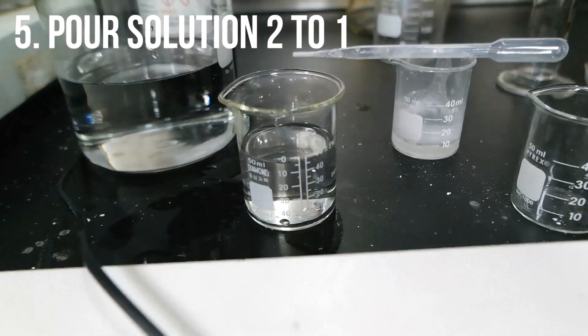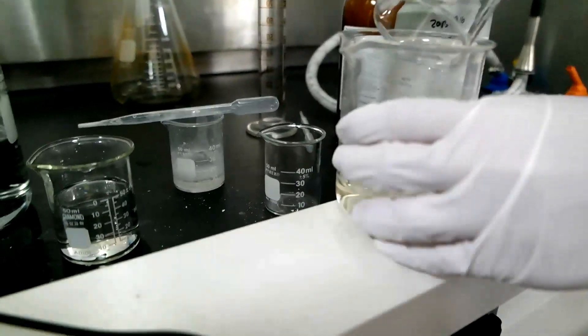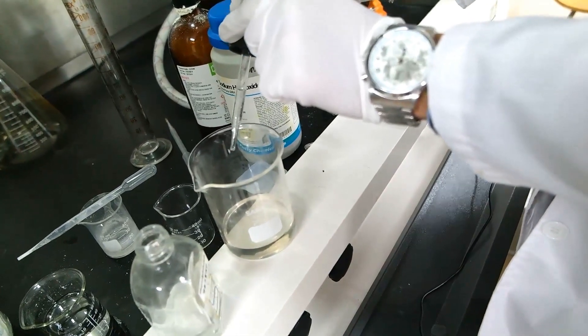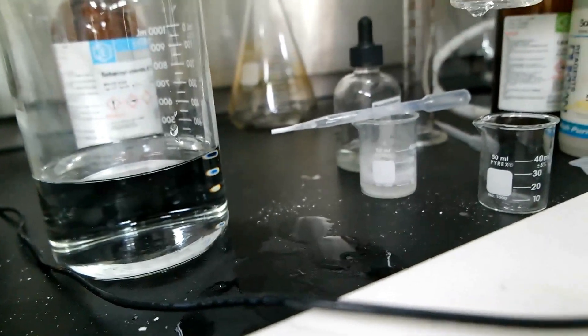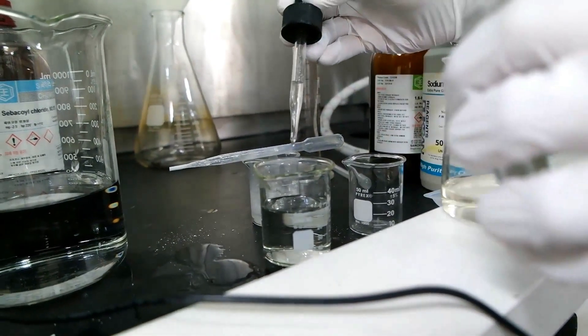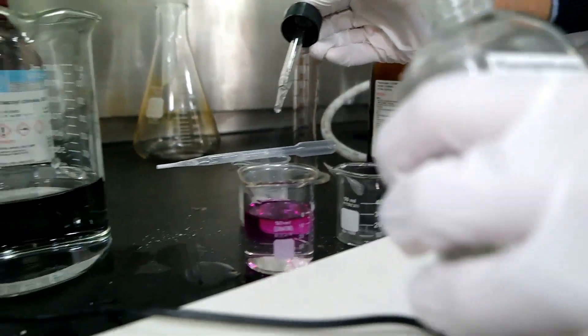Pour this to that — but do you think we should use a bigger beaker? Yeah, let's use a bigger one. Let's use phenolphthalein, because we want to see the two layers. Three to four drops of phenolphthalein. The basic solution is going to turn pink. They form an immiscible layer — two layers. If you add more, the color will be more intense.